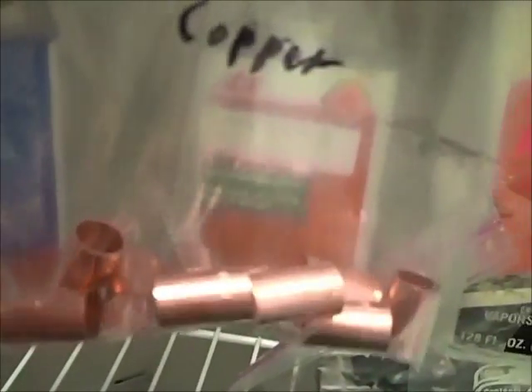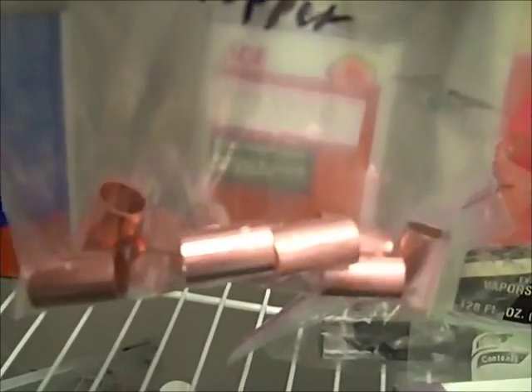And next is copper. You can get it from pennies made before 1982, but those are kind of hard to come by, so I bought some copper fittings from a hardware store for around $3 for 200 grams. And finally is lithium metal. This is being kept in a vial under some oil. I got it from an Energizer Ultimate Lithium battery. It was kind of hard to open, so I only got one out of the two samples of lithium. But if you add it to water, it really is quite spectacular.